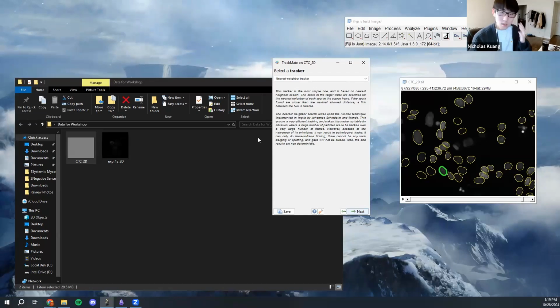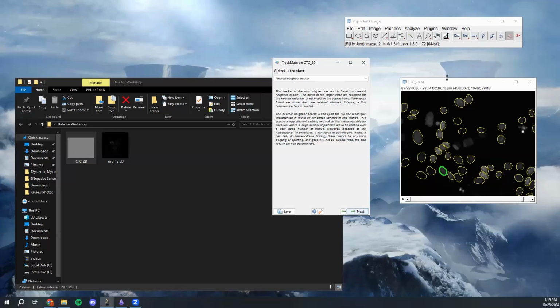Okay. Should I go into the 3D data? I can do the 3D part.